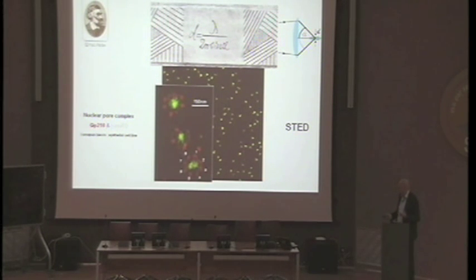You find, say, molecular subunits. In here you see what it looks like, what the range is like. Because the spatial resolution here is of the order of about 20 nanometers in the red channel and about 30 nanometers in the green channel. This is what a confocal would look like. Well, you can compare it or not, but this is what we can do now.